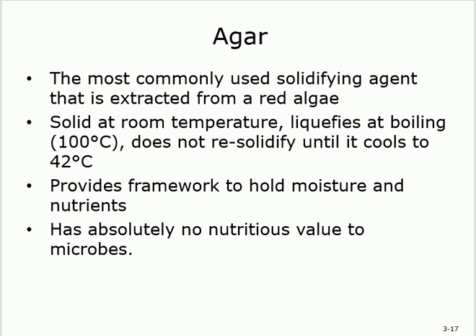So what's the importance of that agar? It provides a framework to hold the moisture and the nutrients. So the moisture will stay. Whatever the status is, semi-solid or solid, it's not going to change. You're not losing the water, for example, of that medium. So it acts like a framework, like you're putting a cover on something, so the water does not evaporate.